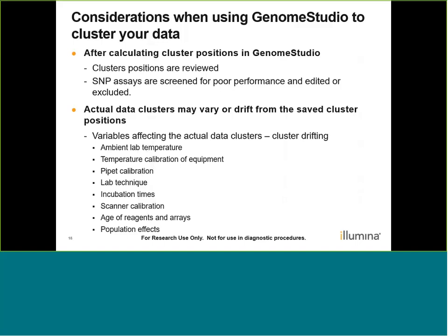Additionally, cluster positions may drift from the saved cluster positions, and the things that can affect that are laboratory conditions, including temperature calibration of equipment, pipette calibration, even laboratory technique, variable incubation time, and especially things like age of reagents and arrays. So we strongly discourage using expired reagents and arrays.